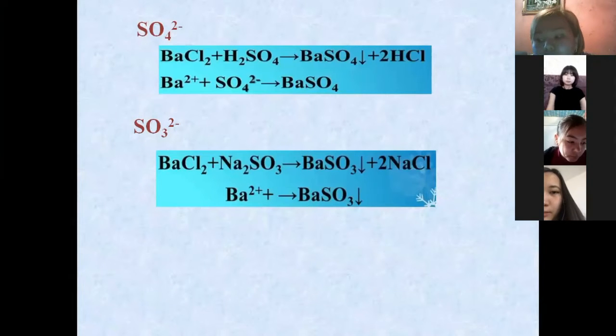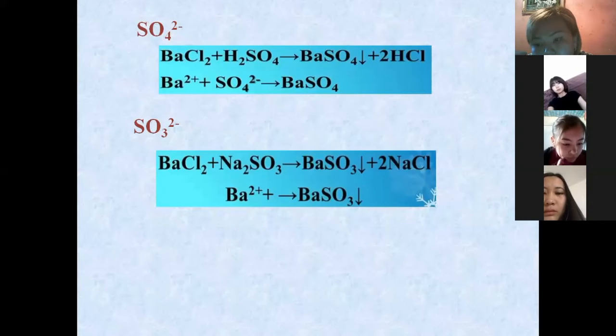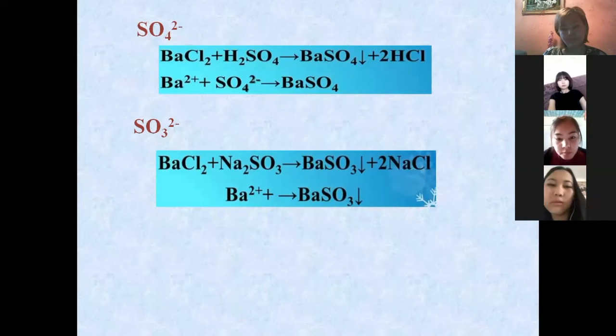Let's write down the main reaction that we saw in the video. First, let's read the reaction. Aruzhan, please read. We interact barium chloride and sulfuric acid, and we get barium sulfate as the sediment, and hydrochloric acid is formed.